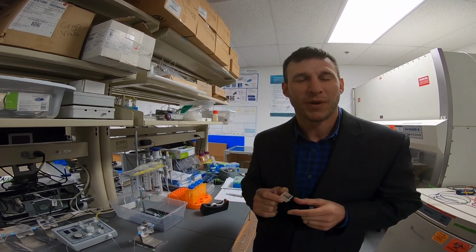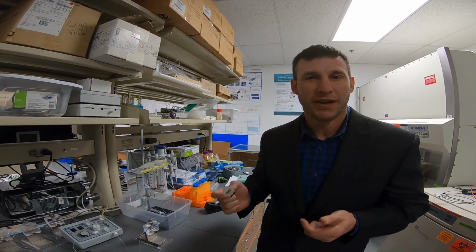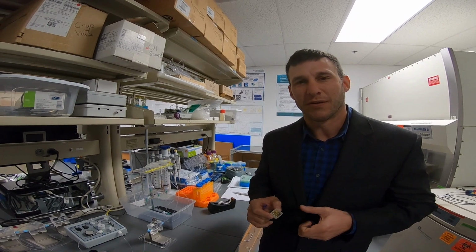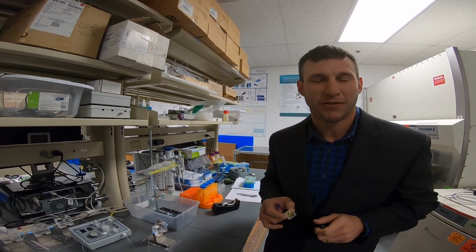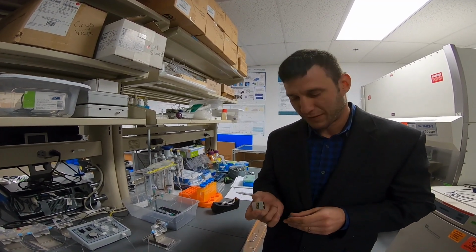And so we're working with many types of sensors and sensing techniques in our lab, including electrochemical sensing and impedometric sensing. These techniques allow us to integrate new types of sensors with processes to improve their quality and also to control the processes in novel ways.